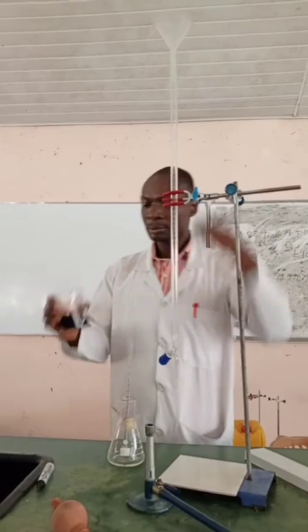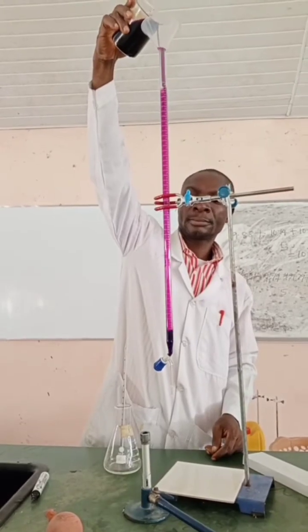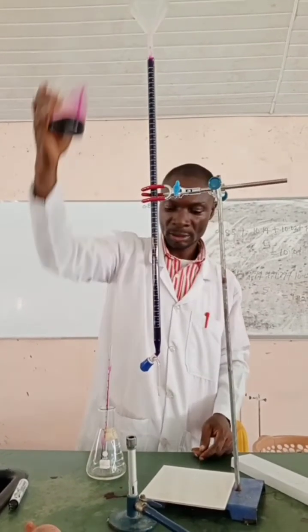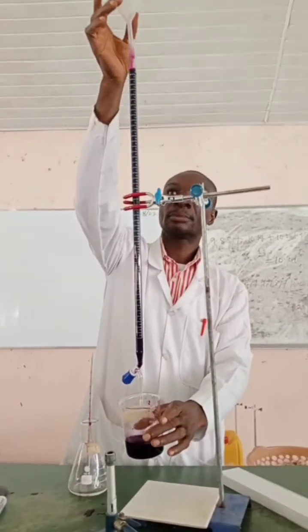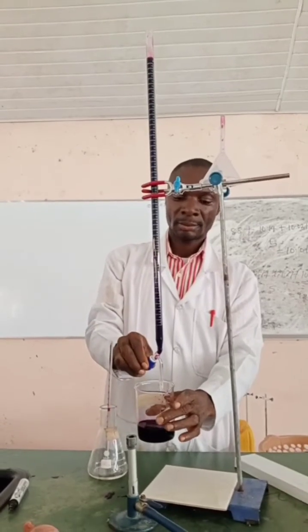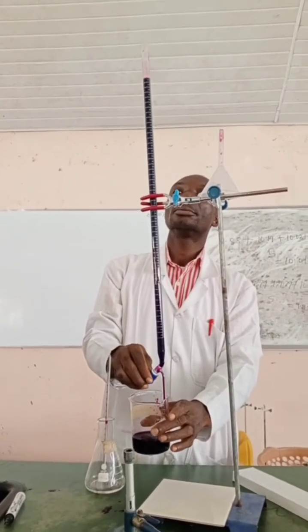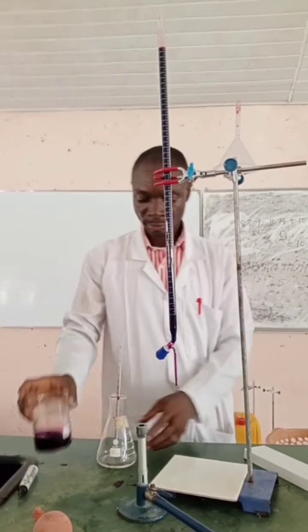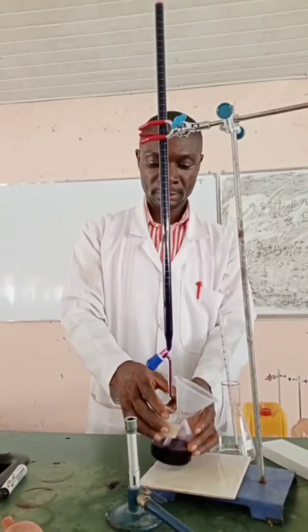After heating, you quickly take it to your titration point setup to titrate quickly. You need to fill the burette with potassium permanganate solution whose concentration is unknown — that is the aim of this titration, to determine the concentration of the potassium permanganate solution. When taking readings, be very careful. Being that potassium permanganate is a colored solution, consider the upper meniscus as your level. Remove air bubbles at the tip of the burette.